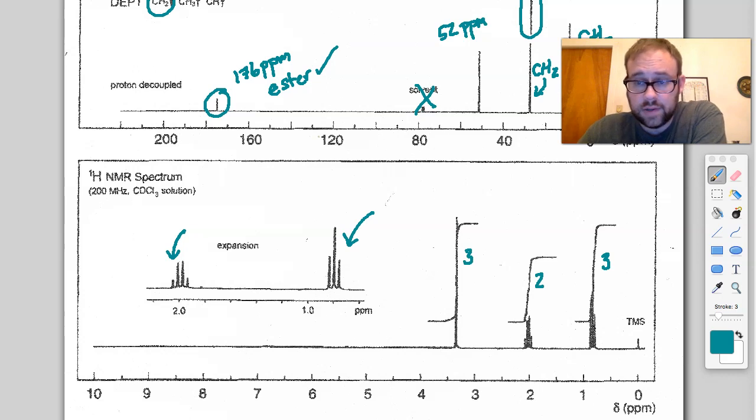Now, if you ever had to figure this out yourself, you know something that below the one region is going to be a methyl group. That's pretty much the only thing that shows up there. So then you take the relative heights of the integration. So we're talking about something like this, and you compare it. So if you look at the one next to it, it's about two-thirds the size. So that's two versus three. And then if you look at the one down around 3.4 ppm, this one is the same integration size as the one over here, right? So when we're talking about the integration, we're looking at the height of this right here. And if you match that, you could pretty much drag it over top of what you've got right here. All right, so it's three, two, three in this case.